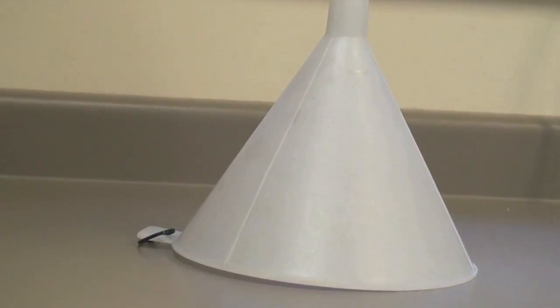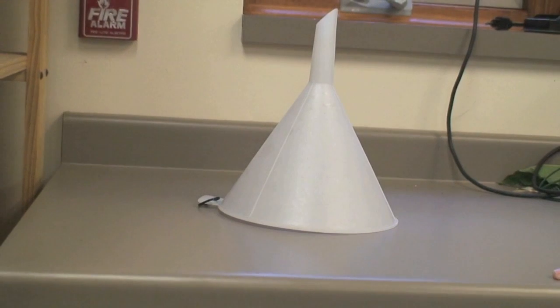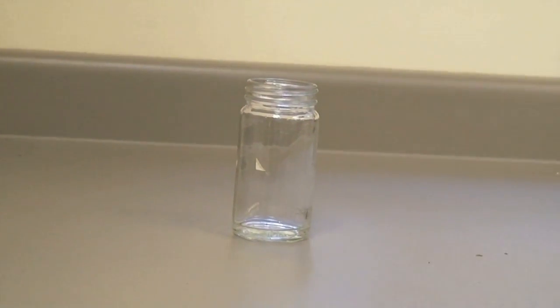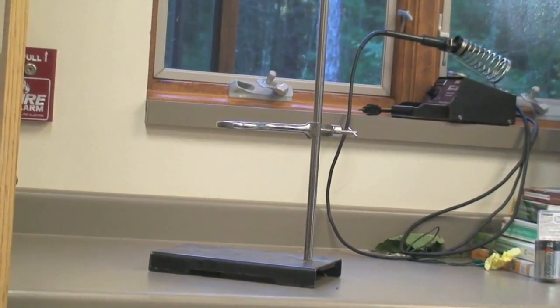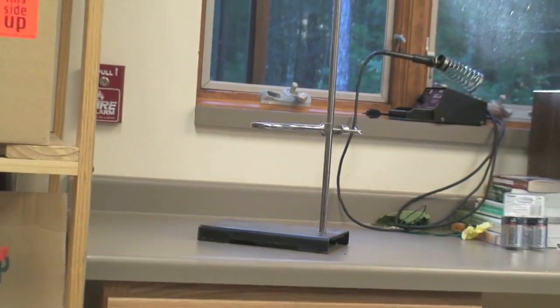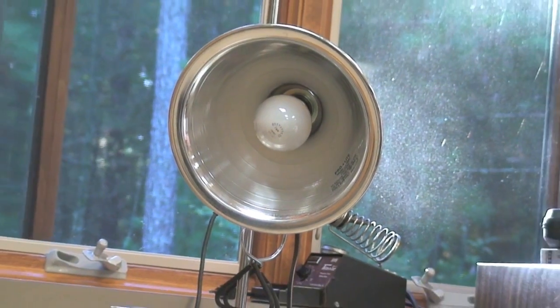To make a Berlese funnel, you need to acquire a funnel that can fit one full soil sample. You will need a jar with one quarter cup of ethyl alcohol. You will also need a sturdy ring stand. The last item you will need is a heat lamp.